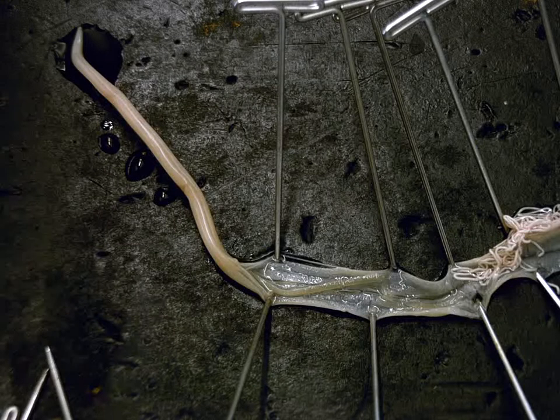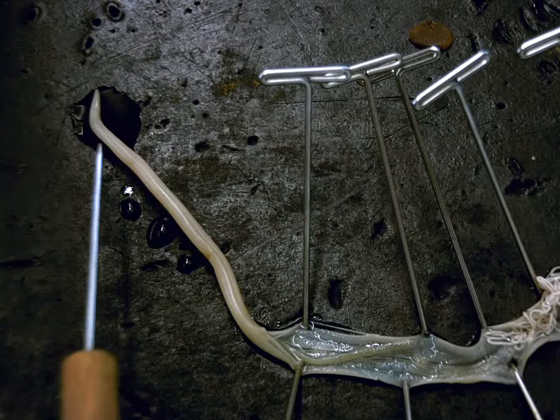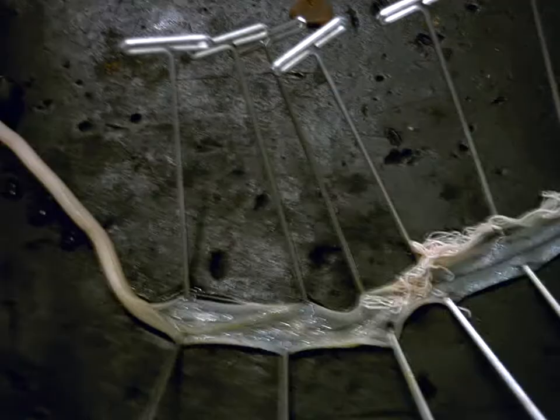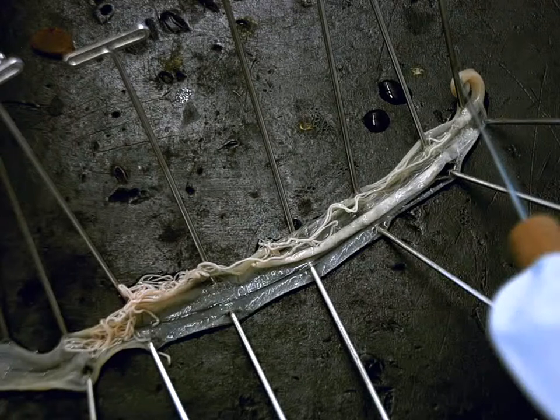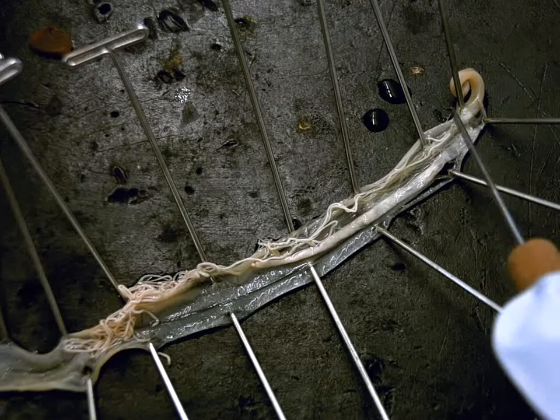And we have the anterior over here, which is where it has its mouth and three lips. And then you can see we move towards the posterior end of the worm where we see the curvy posterior tail.